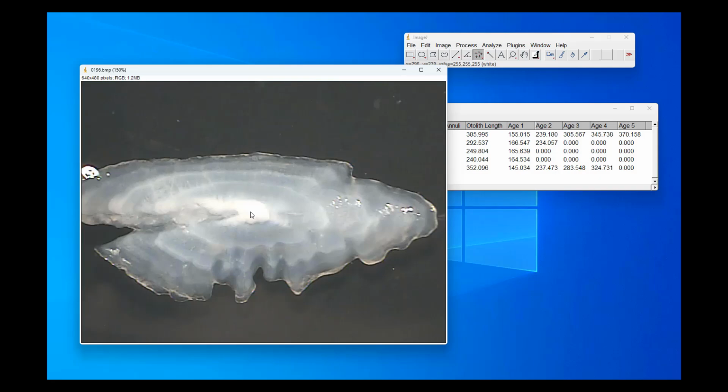And I click on it. You got to click on the image to activate it. Then your next click is the focus. And I can do these in any order. I can come here, and I can come here, and I can come, ooh, this is the tougher one. It looks like maybe there's 1, and then maybe there's 1. You know, I think so.